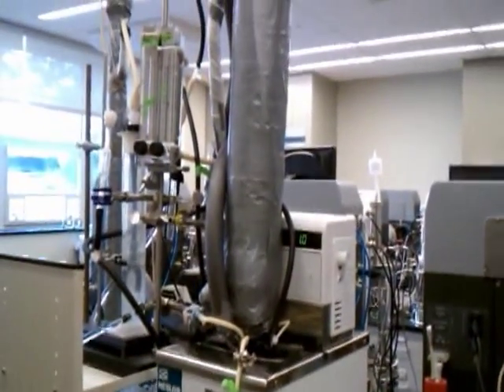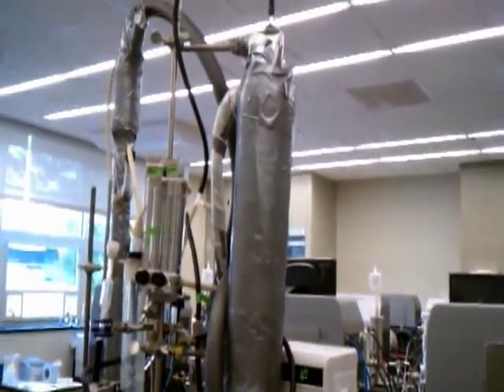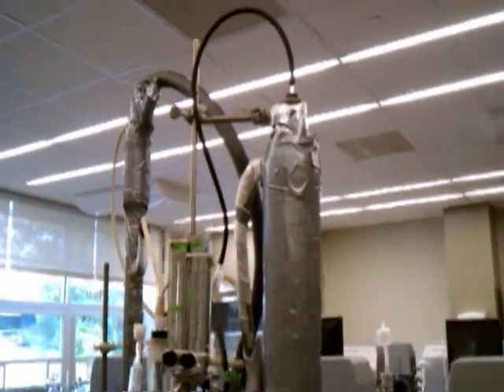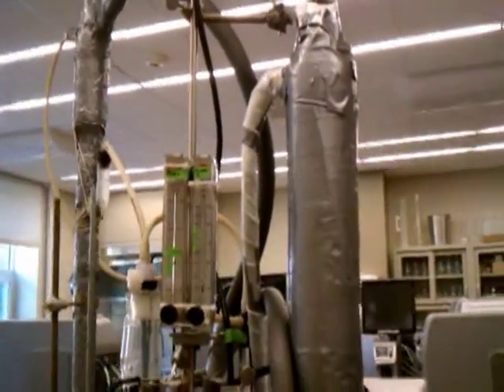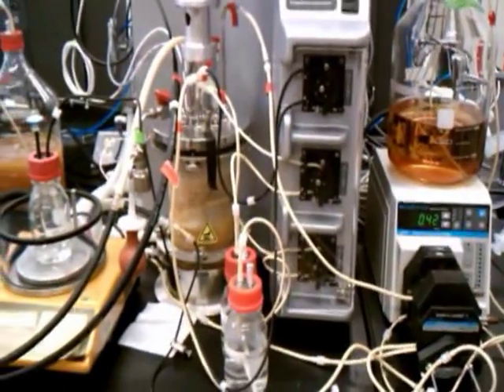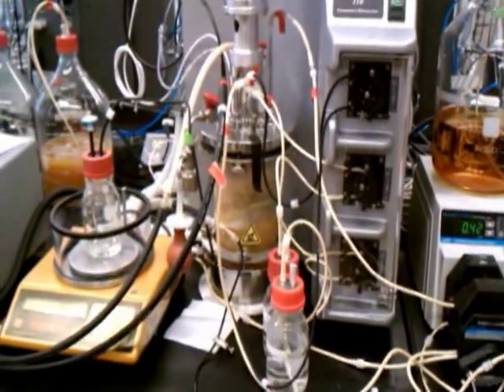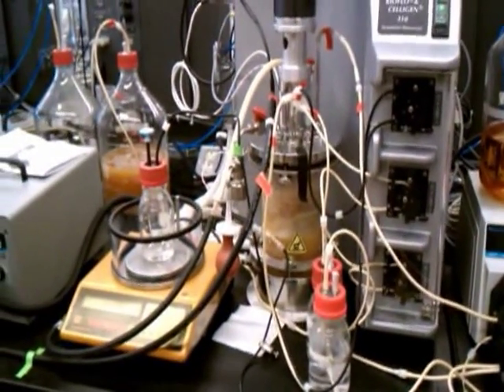In this process, we pump the headspace gas, which is saturated with the produced solvent, from our fermentor through a condenser and collect the stripped solvents. The then dry gas is bubbled back into the fermentor to take up more solvents and continue their removal.